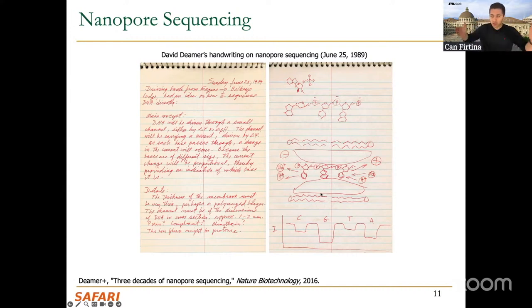Imagine your resolution is so low that, just for you to imagine, we're taking a sample for every 10th base and so on. Whatever we have in between, we would be losing the information. And again, there is a variance of the speed. So it was essentially challenging early on.